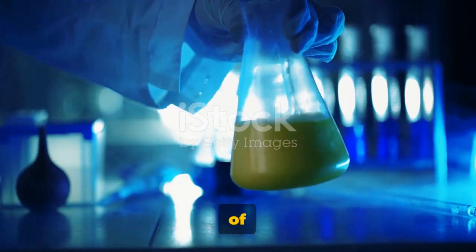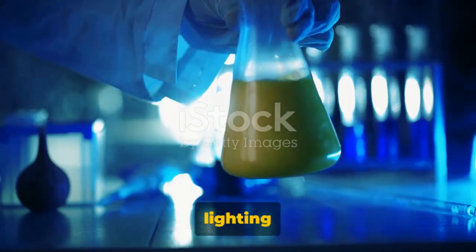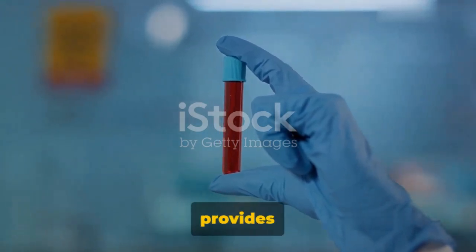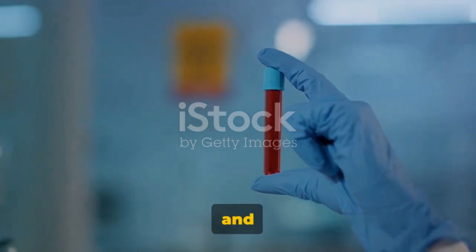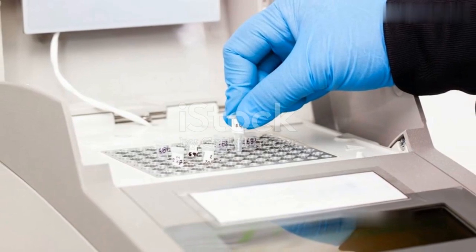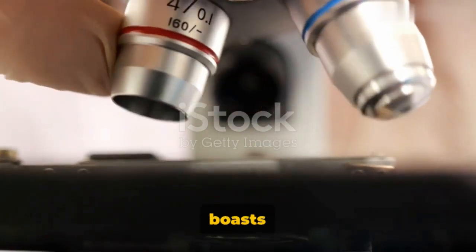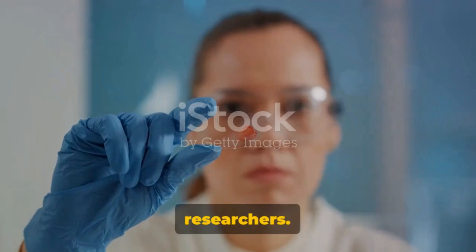However, the cleverness of qPCR doesn't stop there. Fluorescent labels are added, lighting up the process with every cycle. But why the light show? Well, this is how qPCR provides quantitative data. The fluorescence is measured after each cycle, and the intensity of the light corresponds to the amount of cDNA present. The beauty of qPCR lies in its simplicity and speed. It's relatively easy to use and boasts a short assay time, making it a popular choice amongst researchers.